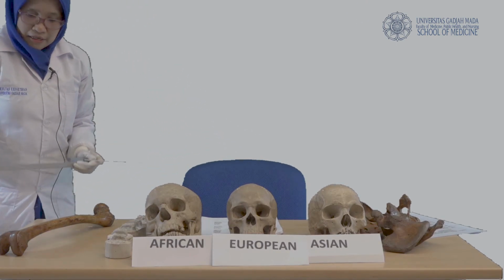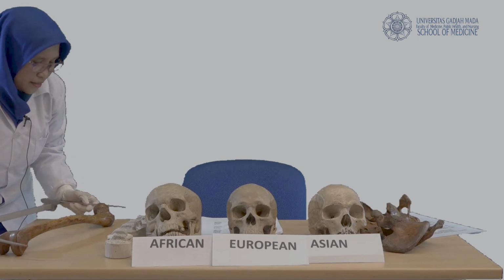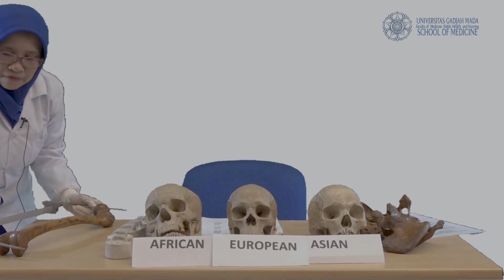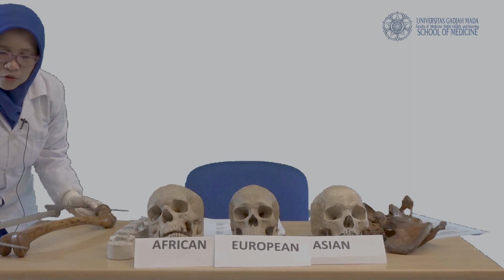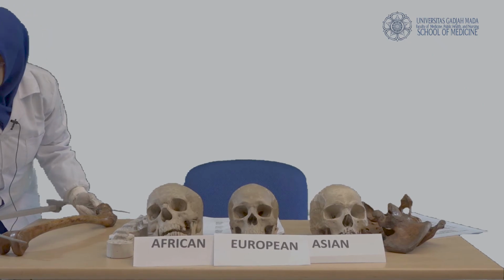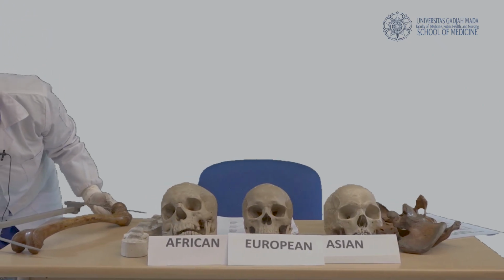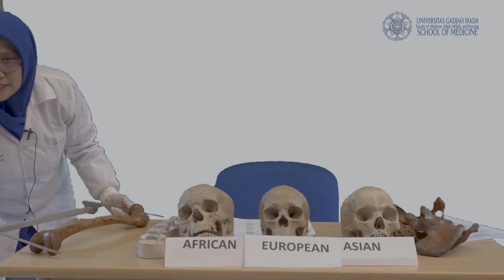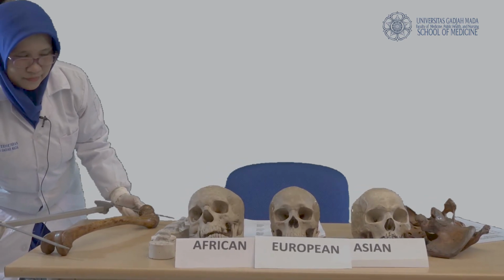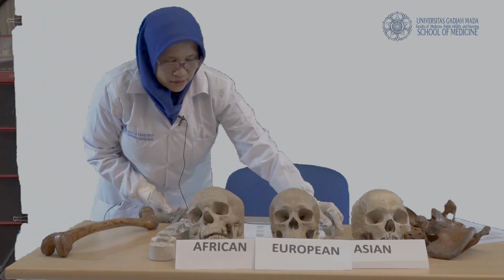Using the long sliding caliper, put the pointer at the maximum distance of the most outer parts of the bone, like this. And then read the scale here. For instance, in this measurement, it is 44 centimeters. This is an example of how to measure the femur.